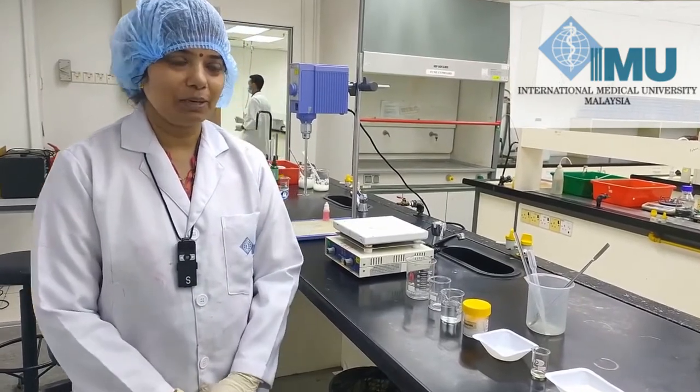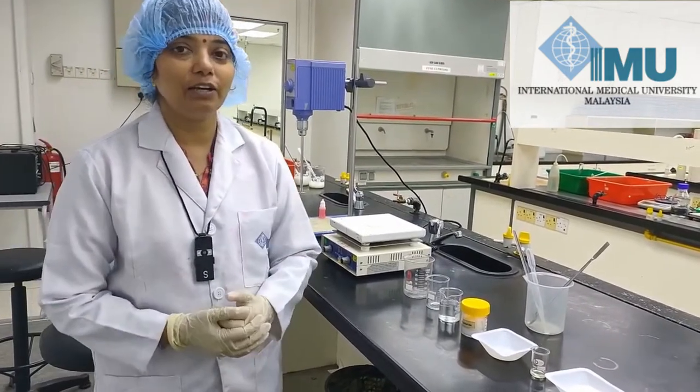Hello students, welcome to Cosmosolubic Practical. In this session we will learn how to make shampoo.